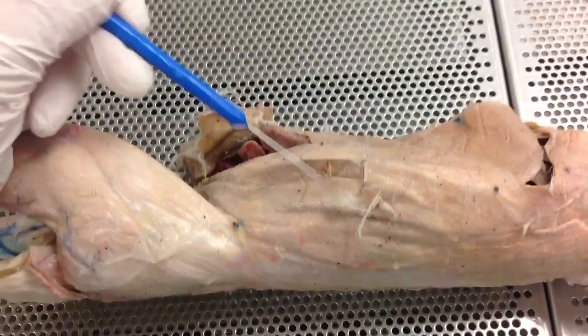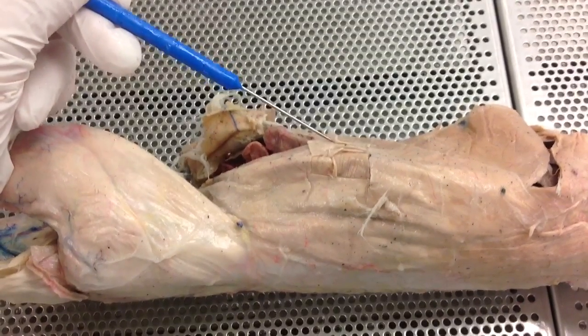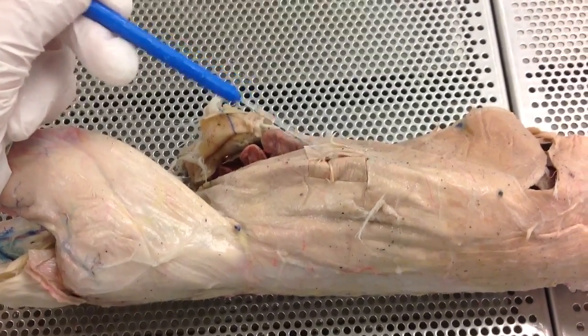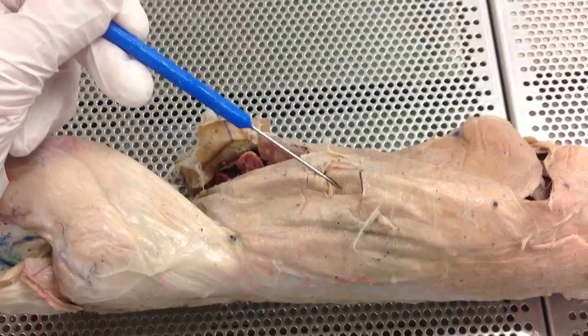We go into the obliques. The skin flap right here is going to be your external oblique. This portion inside is going to be your internal oblique. So external oblique, internal oblique.